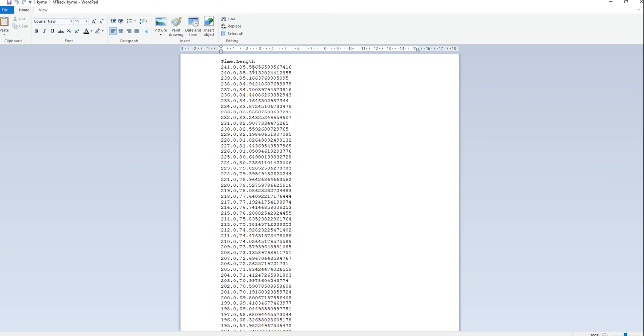And then once you have this time versus length, I'm going to make a module in the next update of MTrack, which is going to take these CSV files and output the kymographs. So stay tuned for the update and keep a lookout for the MTrack update next, which is going to have this functionality of giving you the fits coming from your own kymographs rather than the kymographs which MTrack produces by automated tracking.